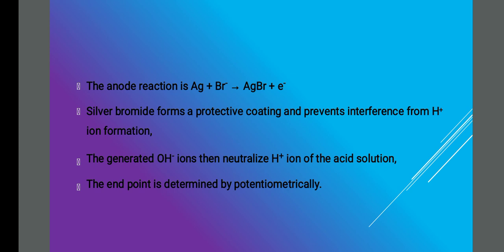I'll say the second point once again. So neutralization of acid can be done, also base can be done. முதல்ல base க்கு, directly water oxidize பண்ணி H plus ions கொடுத்துரும். அது OH minus of the base கூட react பண்ணி water form பண்ணிடும். இது potentiometric ஆ கண்டுபிடிச்சிடலாம். But for acid you should not do it that way. நம்ம 2 electrode எடுத்துக்கிறோம், ஒரு platinum cathode ஒரு silver anode. Solution acid solution containing 0.4 molar sodium bromide வச்சு electrolyze பண்றோம்.